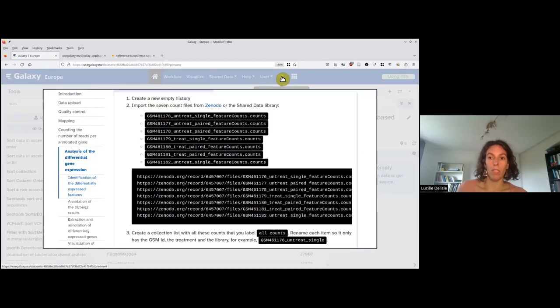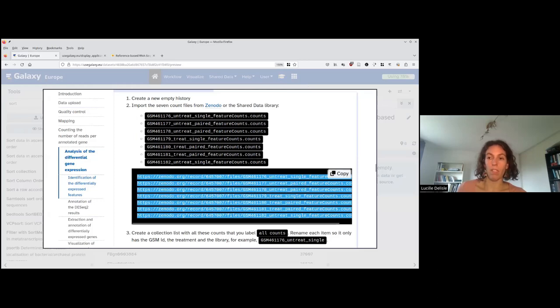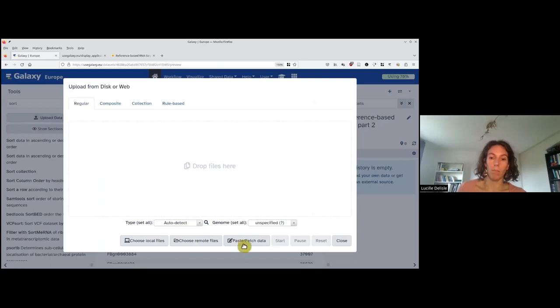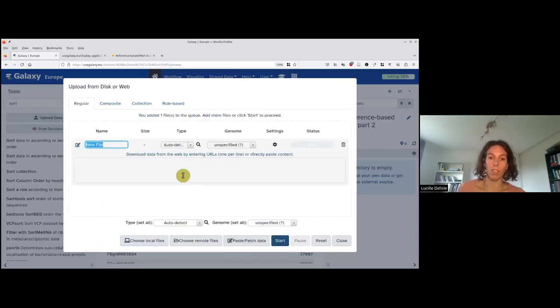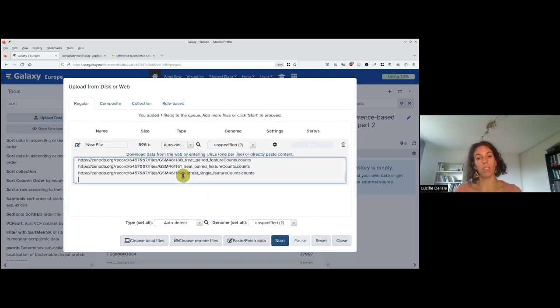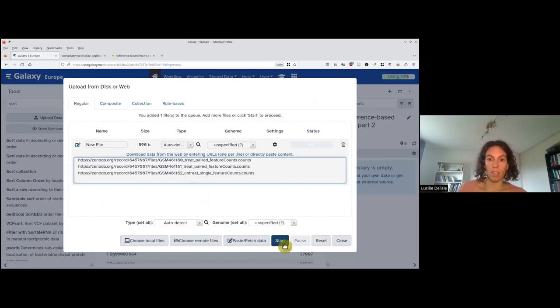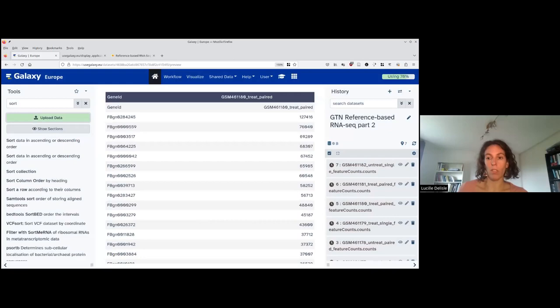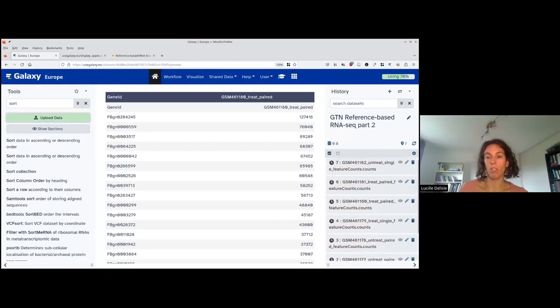I come back to the training material and copy all the links, click outside, go to upload data, paste the data, and then I start. I close and wait for the download to start.